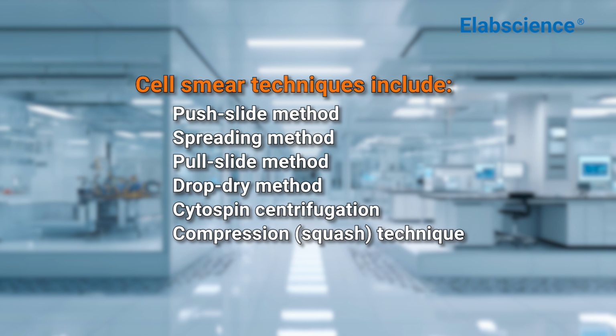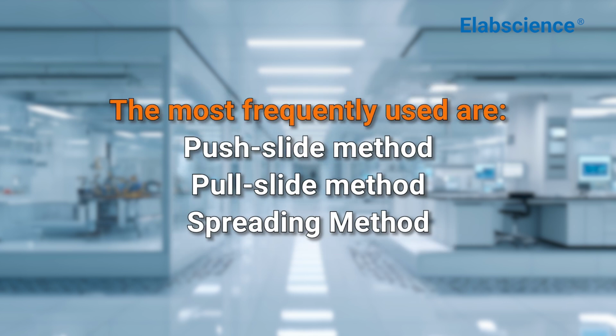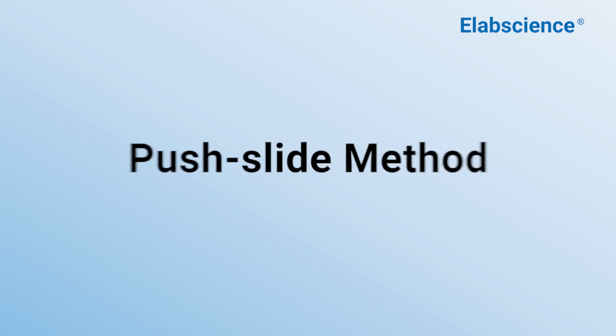Cell smear techniques include push slide method, spreading method, pull slide method, drop dry method, cytospin centrifugation, compression technique. The most frequently used are push slide method, pull slide method, spreading method.